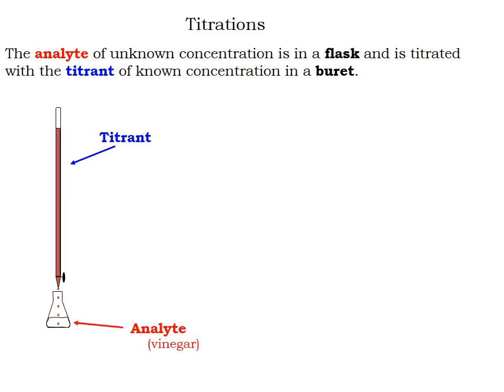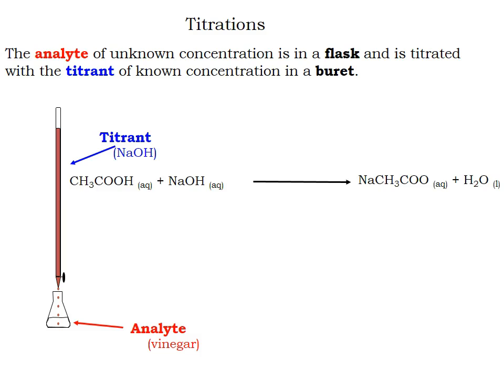The titrant for our lab is sodium hydroxide. It is a very popular titrant. This is the reaction that occurs, the neutralization reaction between acetic acid and sodium hydroxide to form sodium acetate on the right and a molecule of water.